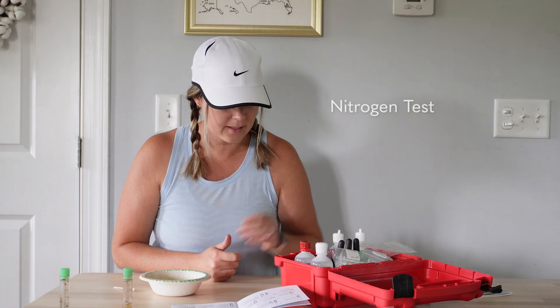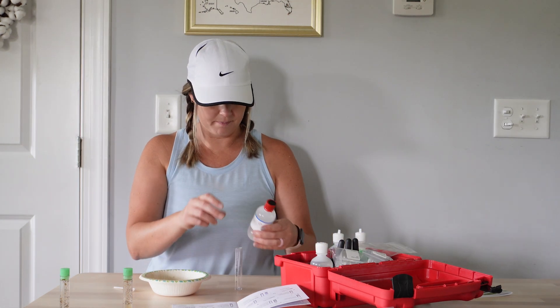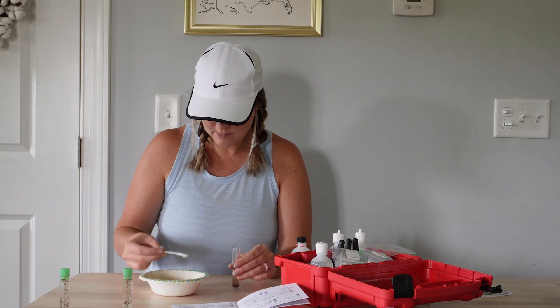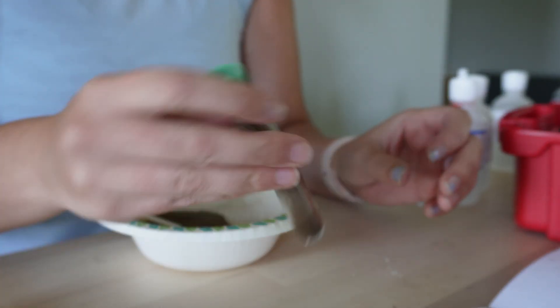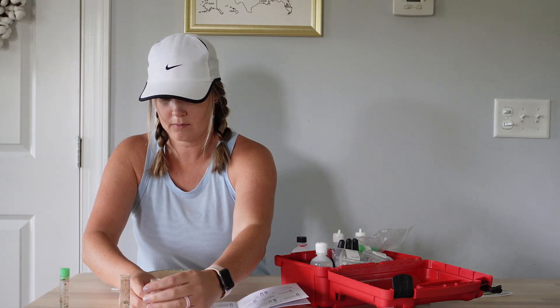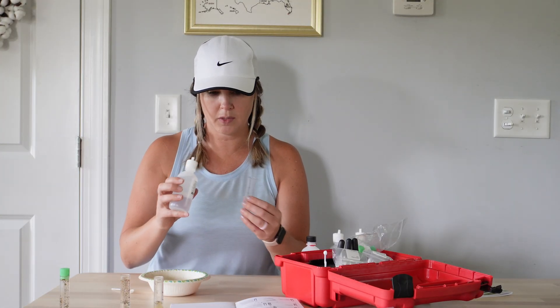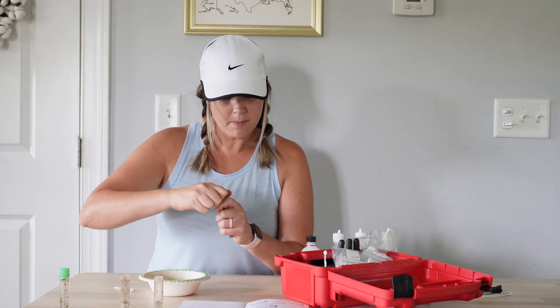We're going to fill to seven milliliters and add two measures of soil. Remove cap and allow soil to settle. Now we will do the potassium test — fill the test tube to seven milliliters with potassium extracting solution. Each of these bottles is 120 milliliters, so you'll be able to do several tests with this — that's why we got this kit. Remove cap and allow soil to settle.